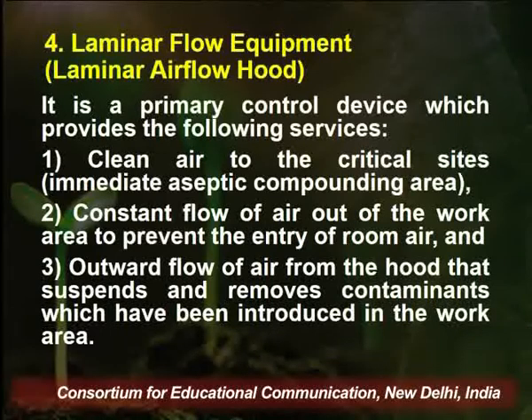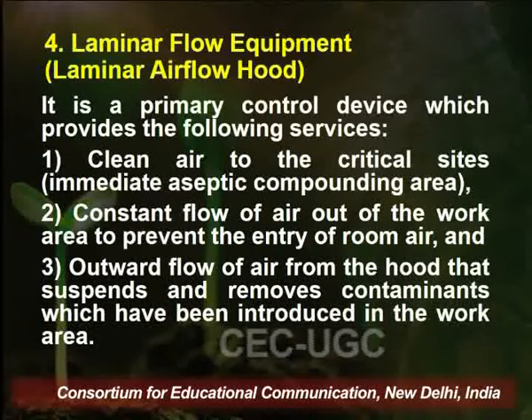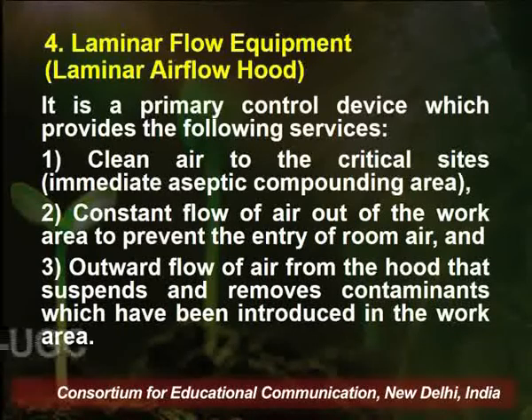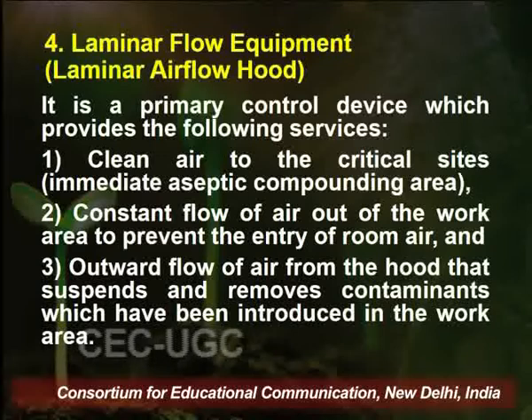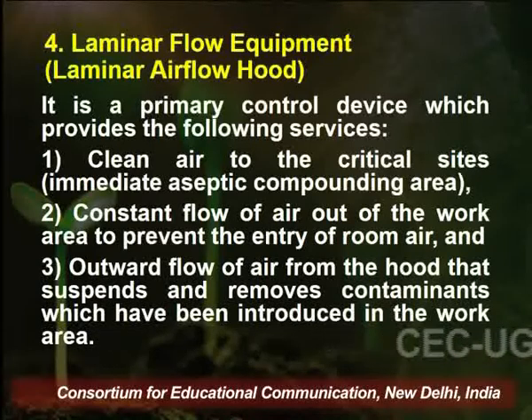It can also provide constant flow of air out of the work area to prevent entry of room air, and an outward flow of air from the hood that suspends and removes contaminants which have been introduced in the work area. So there are multiple uses of this instrument, which we call laminar flow equipment.